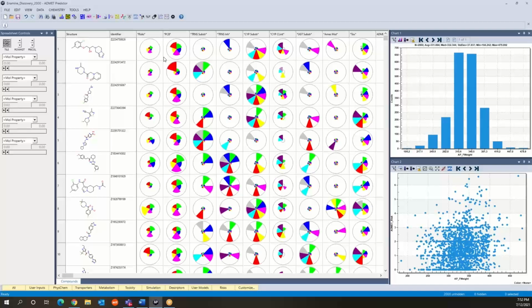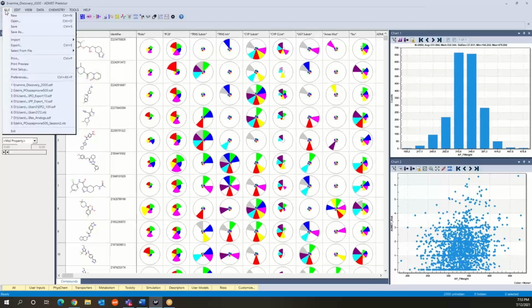So the calculations that you saw were performed on a pretty standard Dell laptop, and as you were able to witness, they were pretty fast. The secret to the speed is the use of multi-threading. On this particular machine, I could have used up to 8 processors, and that is set up under the preferences section, found in the file menu.